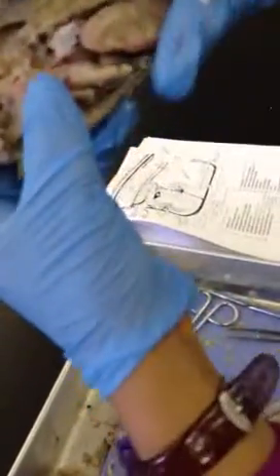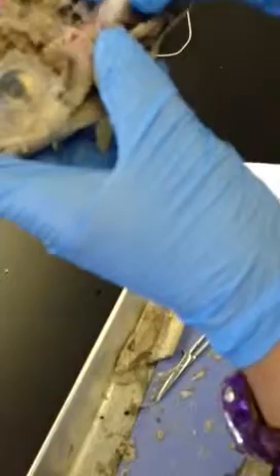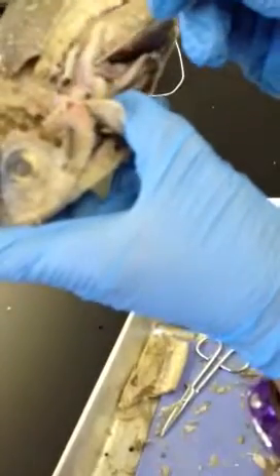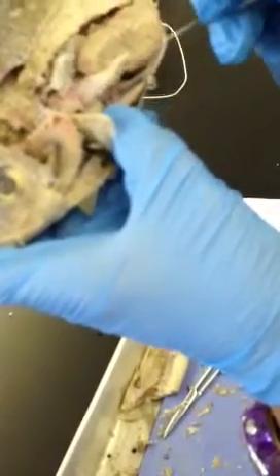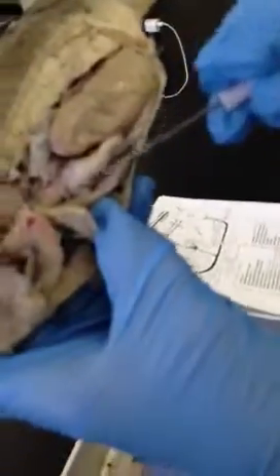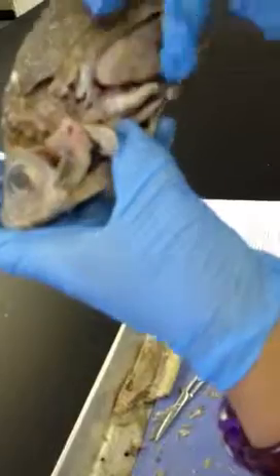So, behind the liver, we have the stomach, right here. This is the fundic portion. Where's the pyloric portion? Right here. So this is the fundic portion. This is the pyloric portion of the stomach, right here.